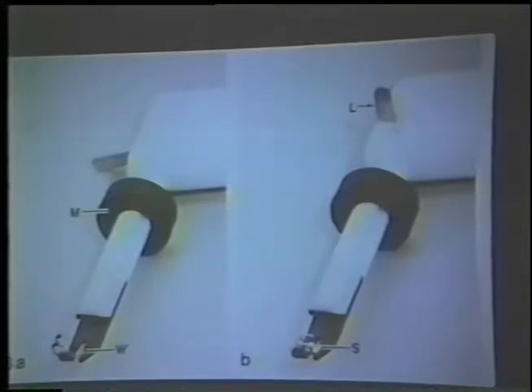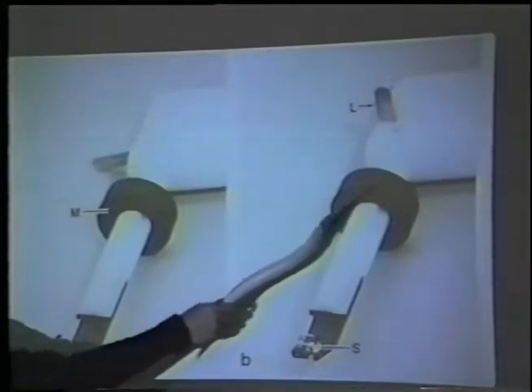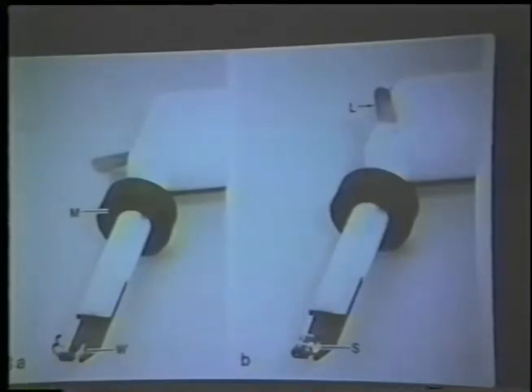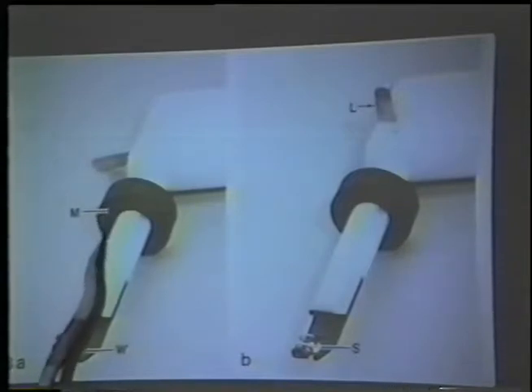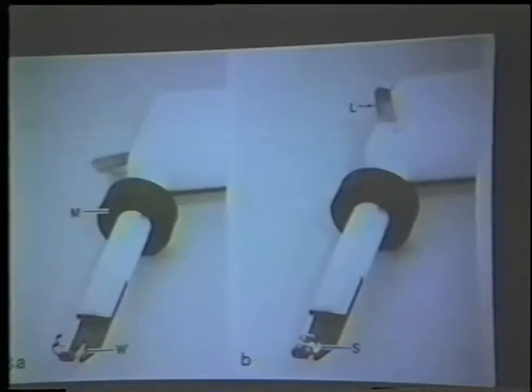You then insert the sample holder into the machine. This ring both stops the sample holder at the port entrance and positions the sample directly between the jets. And there's a magnet here, which you can't really see in this picture. And that magnet closes a reed switch in the sample holder insertion port, which triggers the timer which opens the gaseous nitrogen valve and freezes the sample. So as soon as the sample is between the jets, it's frozen. If you delay, then you get pre-freezing artifact due to the cold gas. That doesn't happen.